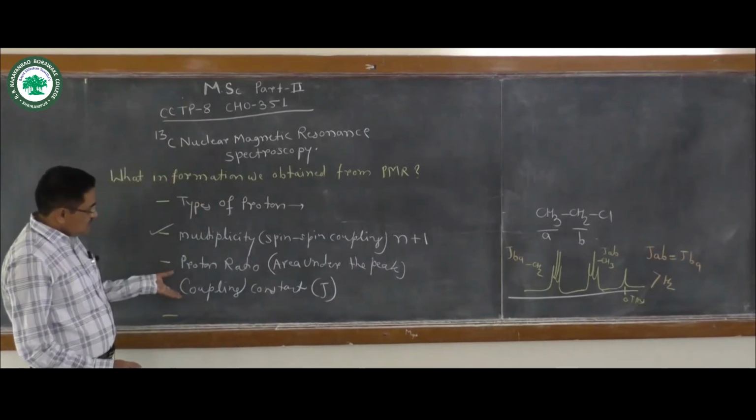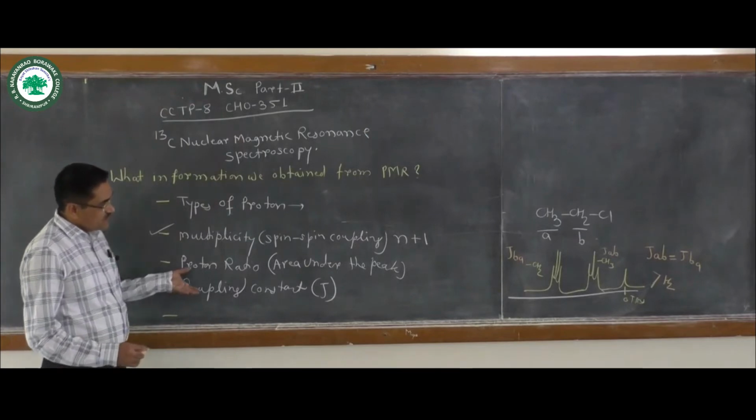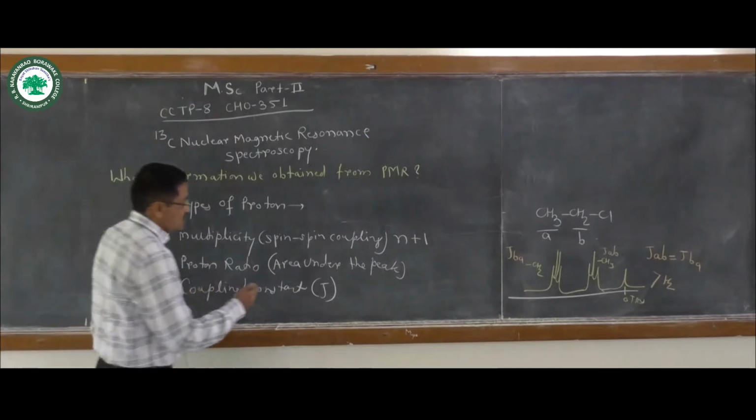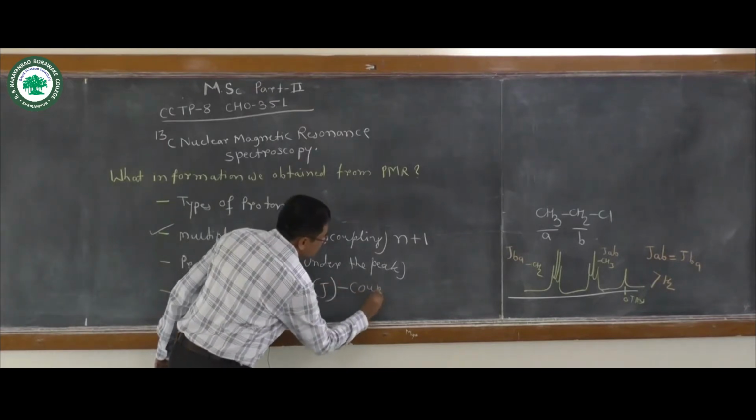Now, what information do we obtain from the coupling constant? That is the coupling partners.